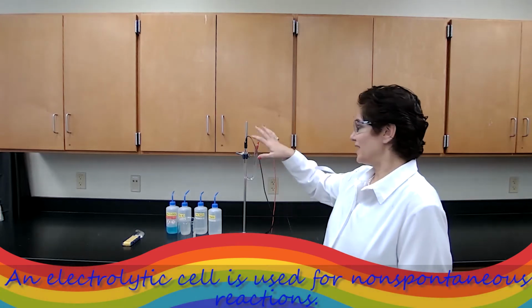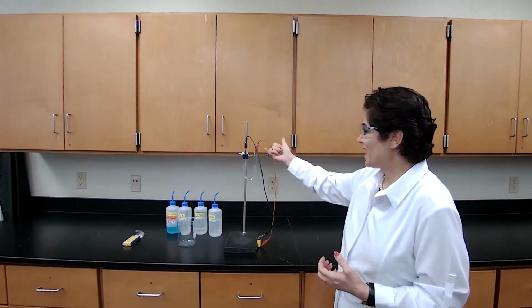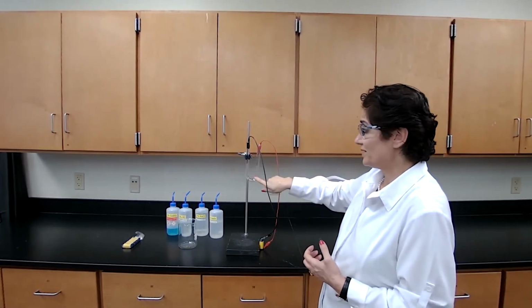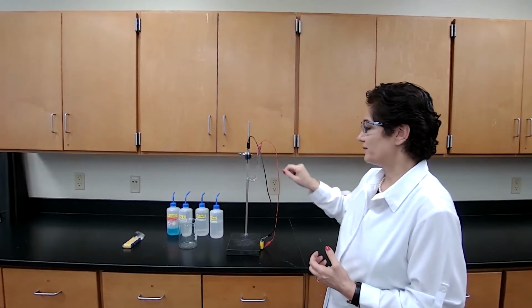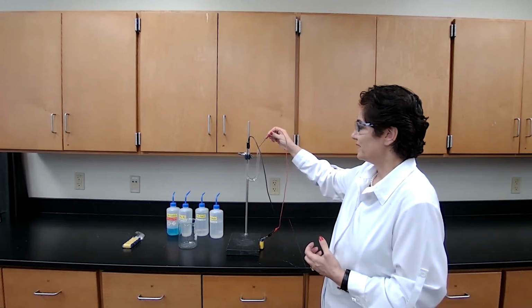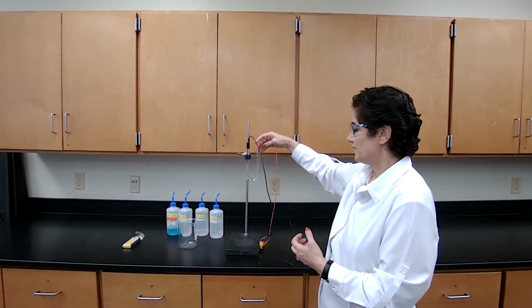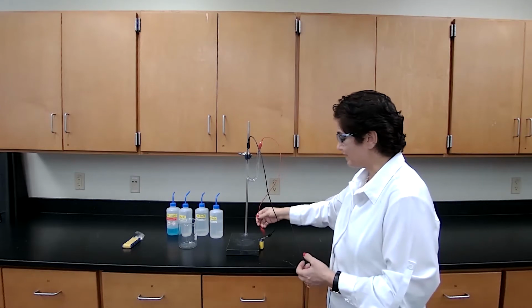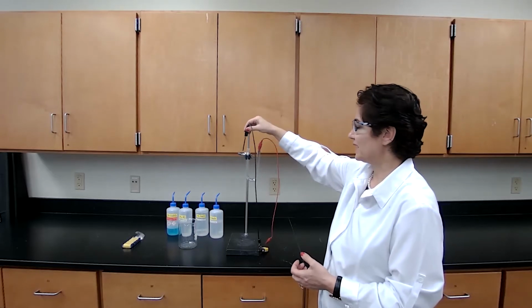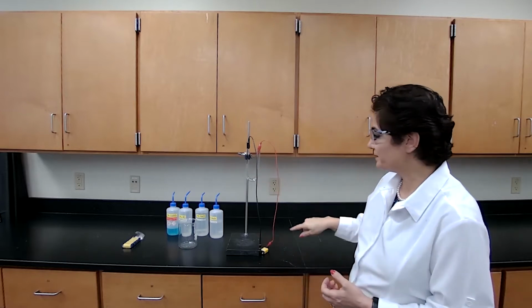The setup for the electrolytic cell is that we have this U-shaped glass tube. We are going to place the liquid to be analyzed inside the glass tube, and we have the graphite electrodes, using the clip. We place one in one arm and connect it to the battery, and the other graphite electrode in the other arm.